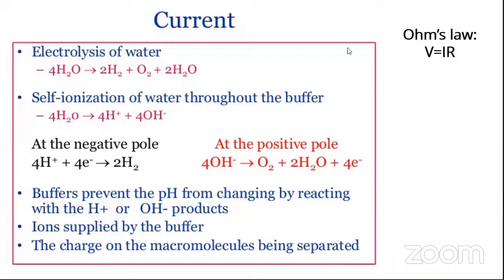Yes. So then if at all, it will be fair to say that if I increase voltage, there will be a proportional increase in current as well as resistance, right? And if resistance increases, there is a big problem for you all.